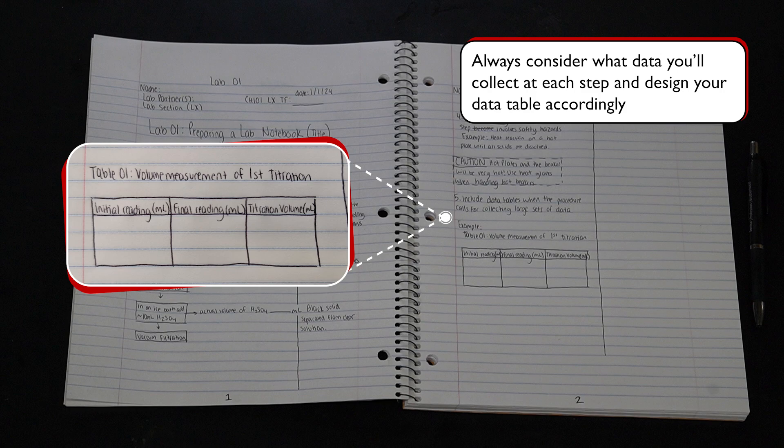Finally, we should make sure that sufficient space is allocated for all expected measurements. For example, each titration volume always involves two volume measurements: starting and ending volumes. And mass measurements also might involve the mass of the weighing boat, and it is likely that you will be making multiple measurements. Keep this in mind as you set up your tables.